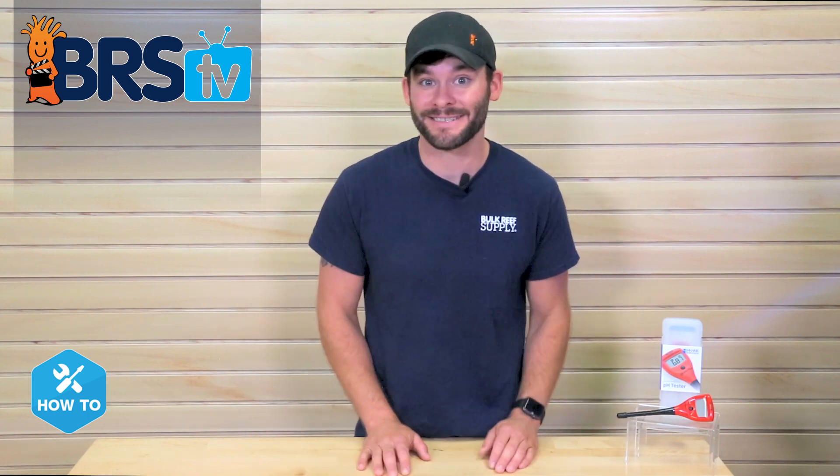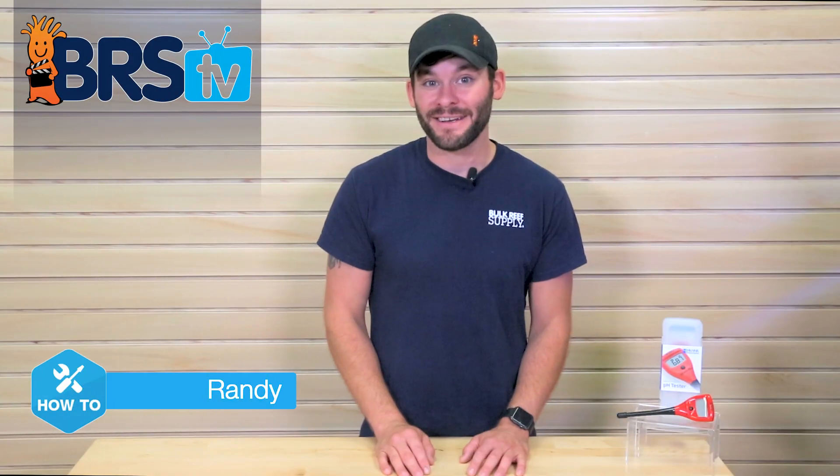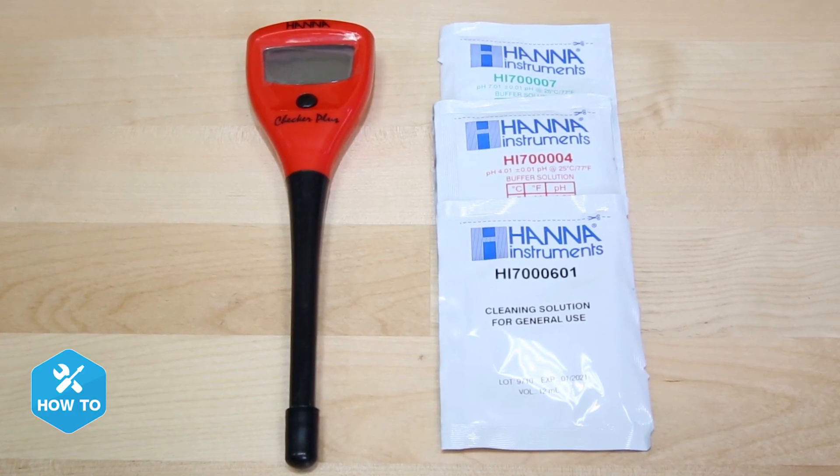Today I'm showing you how to get an instant and accurate pH reading using the Hanna pH Checker Plus. Hi guys, I'm Randy, and today on BRS TV How To, I'm showing you how to test your tank's pH by properly calibrating and using the handheld Hanna pH Checker.